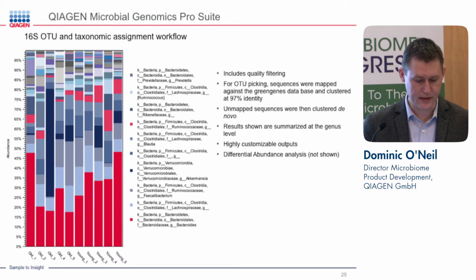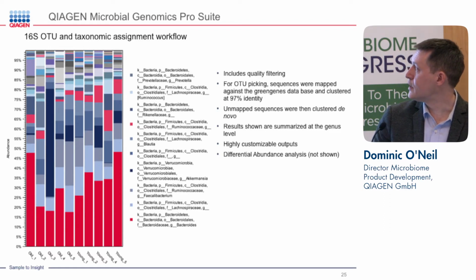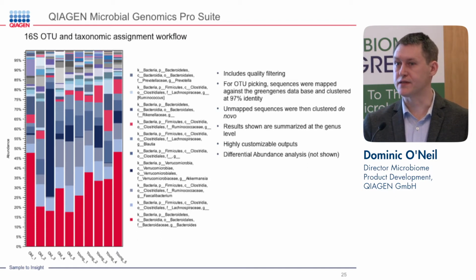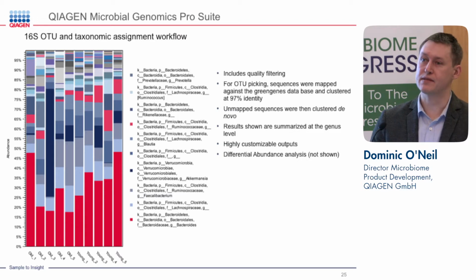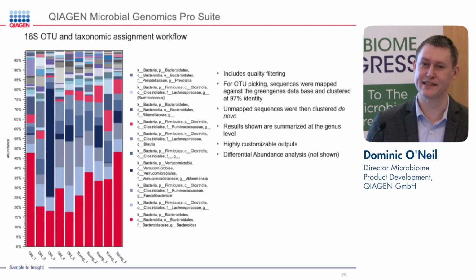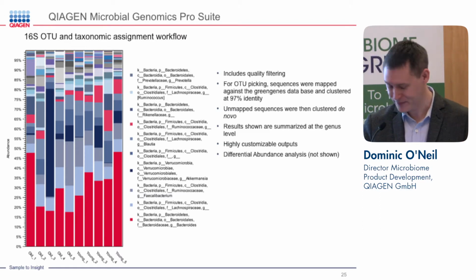Another interesting thing that you could see here is these dark blue bars that show up are actually Akkermansia, which is thought to be associated with a healthy gut microbiome and sometimes used also in probiotics. So it'd be interesting to trace back possibly to diet here and see whether or not this giant block of Akkermansia is somebody attempting to modify their gut microbiome.